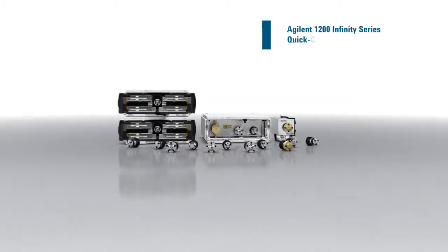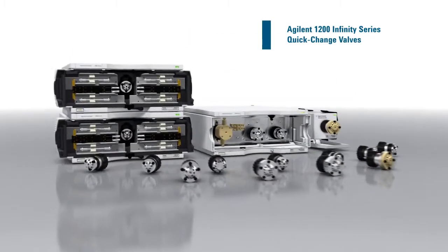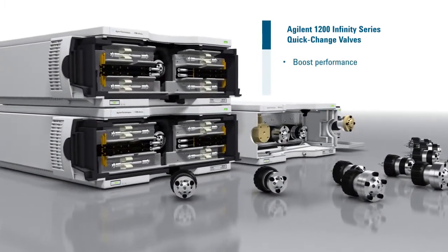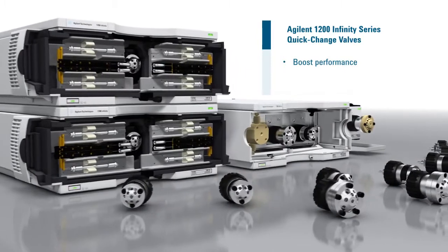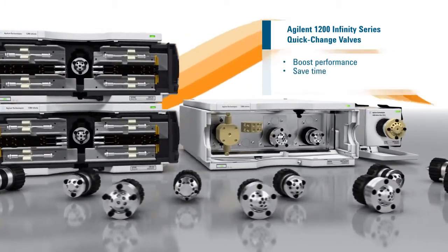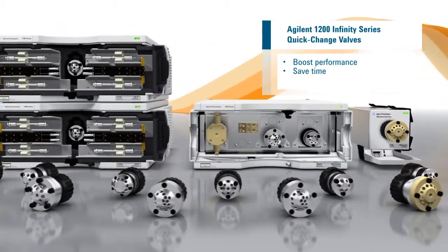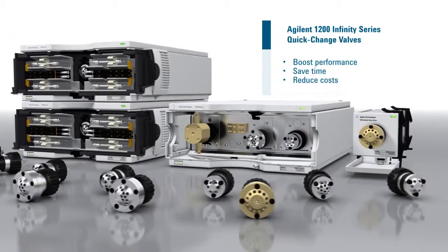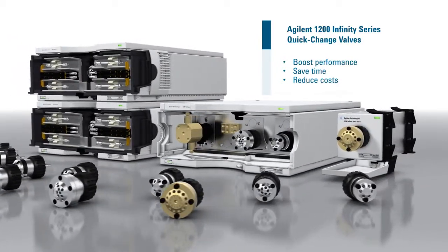Agilent 1200 Infinity Series Quick Change Valves boost performance through advanced valve solutions that address even the most challenging applications. Save time through individual configurations for utmost automation flexibility. Reduce costs through optimized system utilization of a single vendor solution.